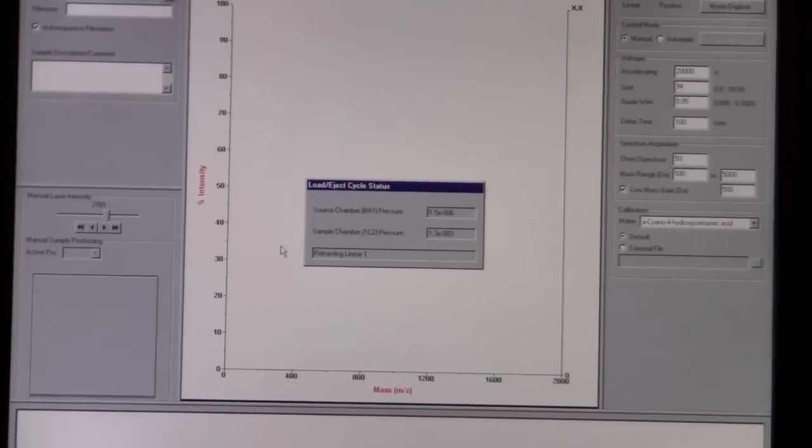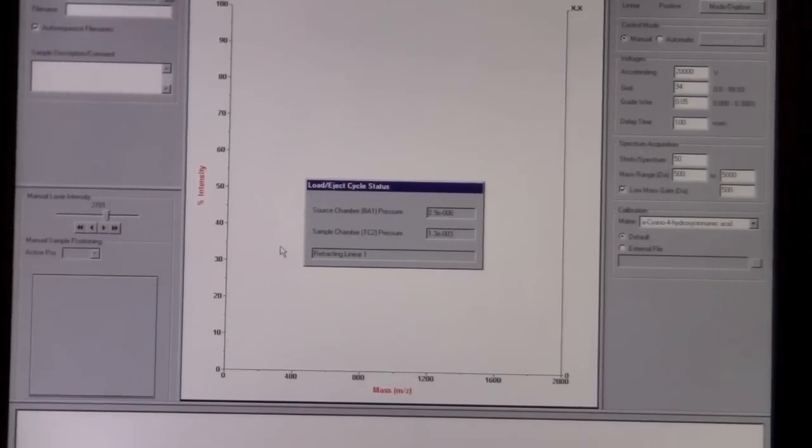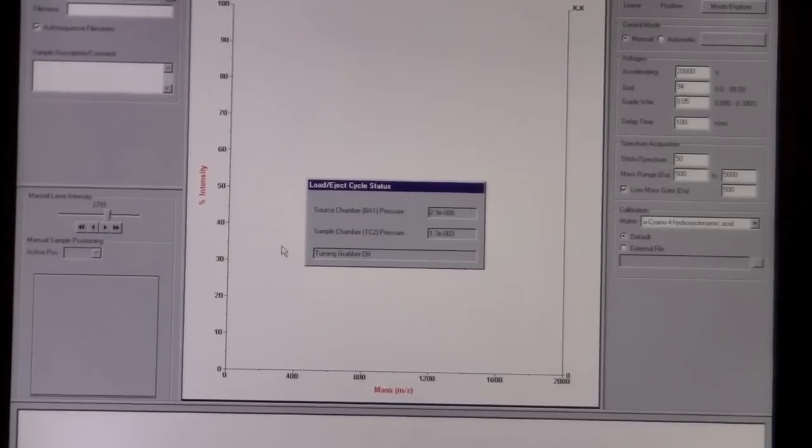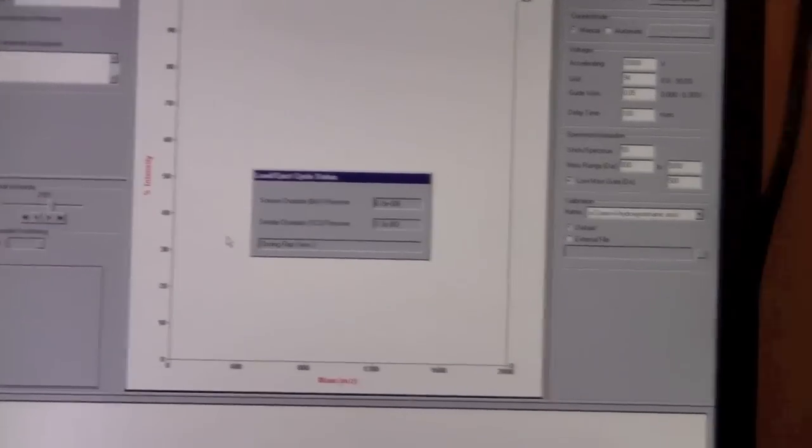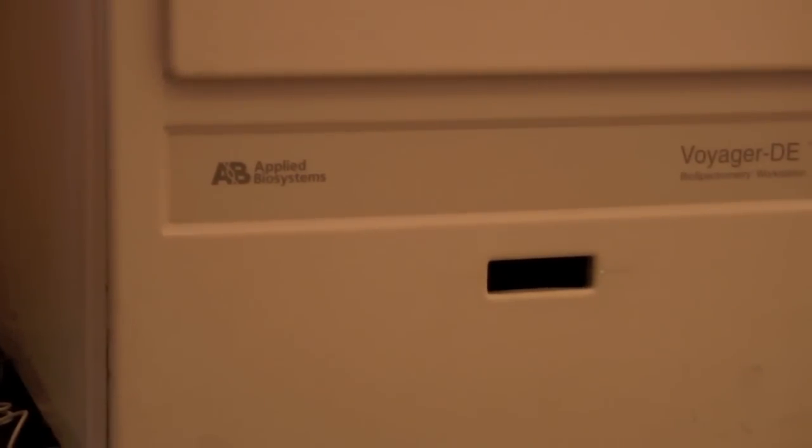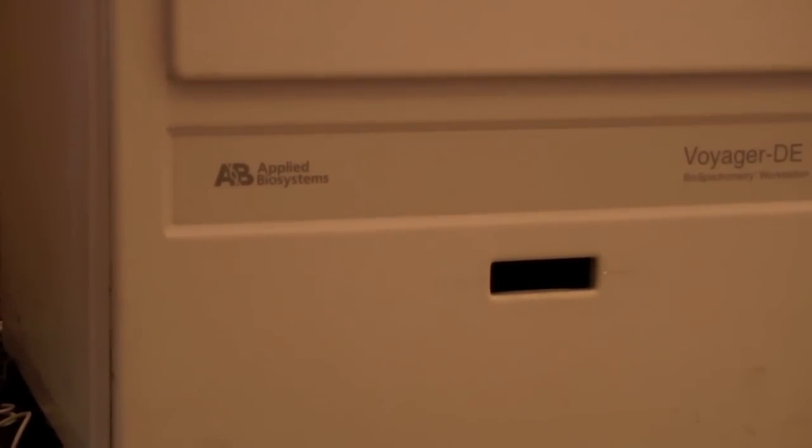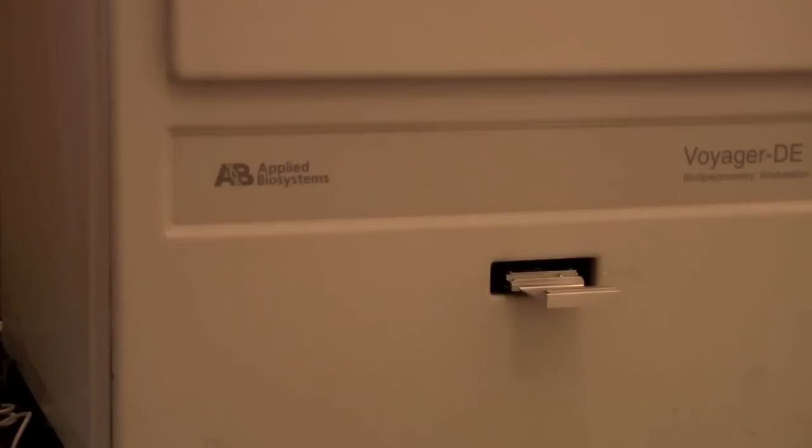The sample plate holder is about ready to eject. We can watch it eject from the instrument. Here it comes.